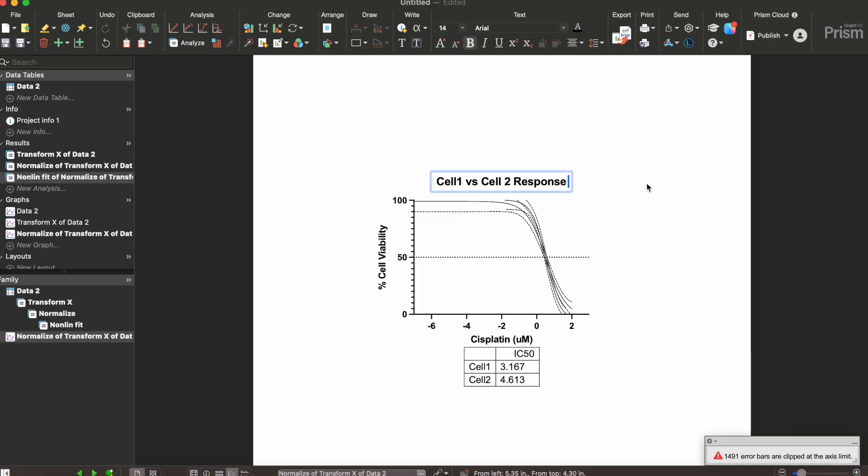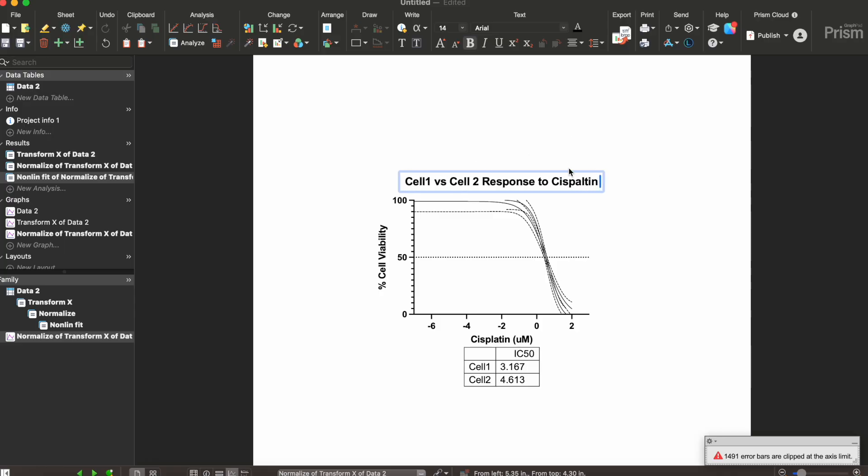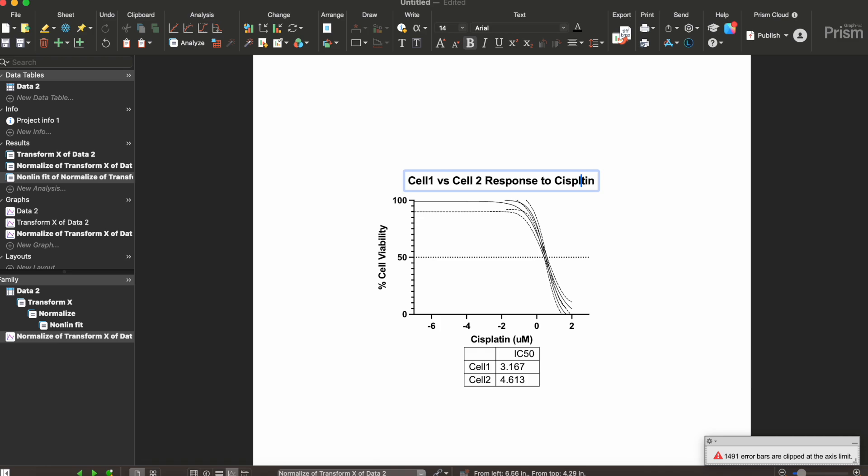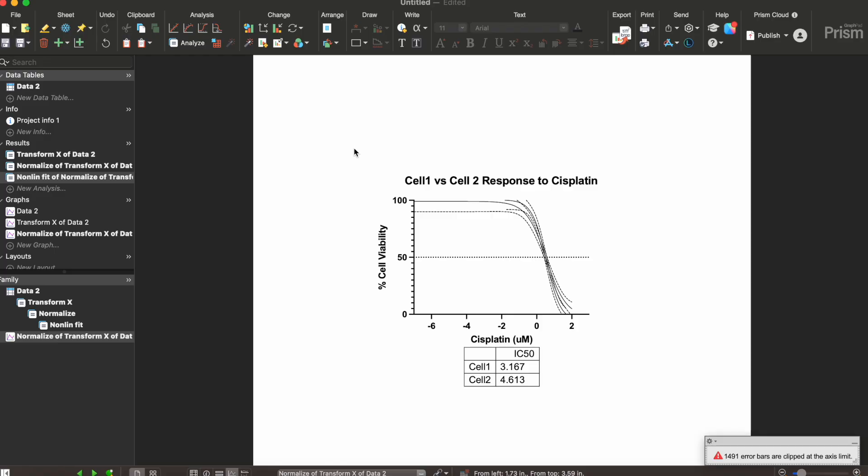And this is how you get the IC50 of a certain drug using an MTT cell viability assay and then analyzing the raw data using GraphPad Prism.